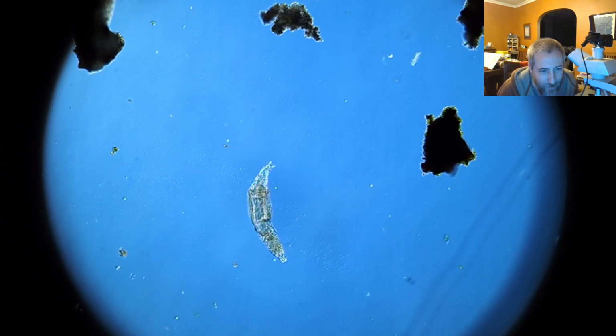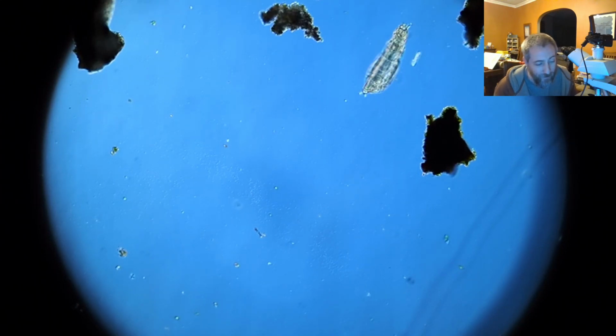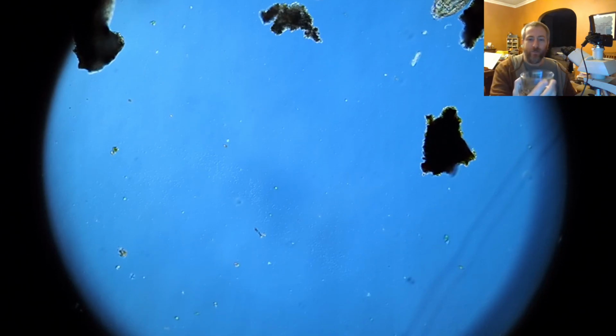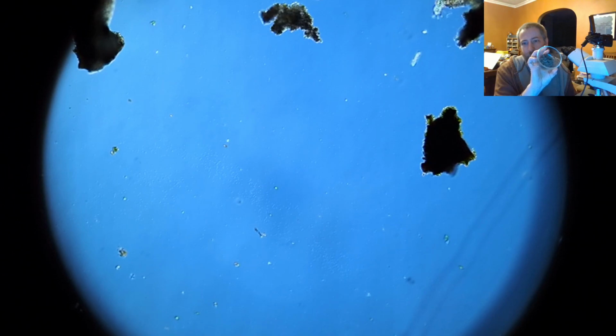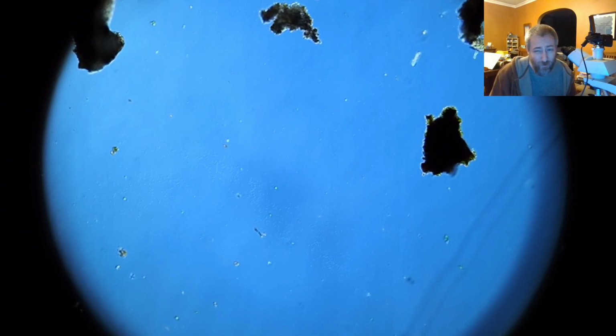Do I know how to keep them fat and well fed long term? Not really. I've been scraping sticks for a while now as I find them, and pulling some water bear samples from basically all of them. A lot of times I just chuck the sticks back out into nature when I'm done with the little bit that I have. But I've been accumulating a dry mass. That's this part right here. It's probably got a bunch of water bears and rotifers that are all dried up in it. And presumably because they eat algae and other organisms, the nematodes and other things that are in them will probably sustain them. But most of the time they're in their cryptobiotic state, so I don't know how frequently is a good idea to get them wet and wake them back up.